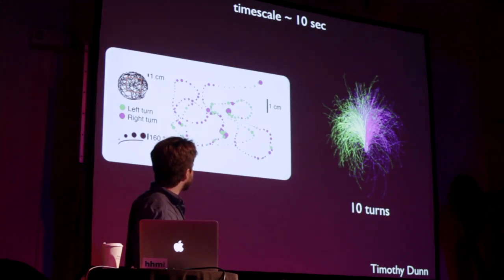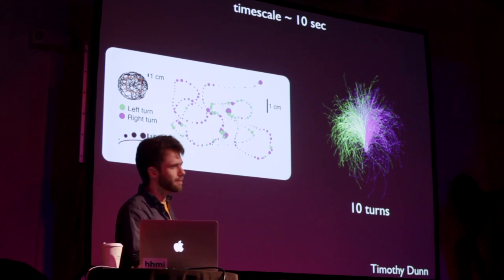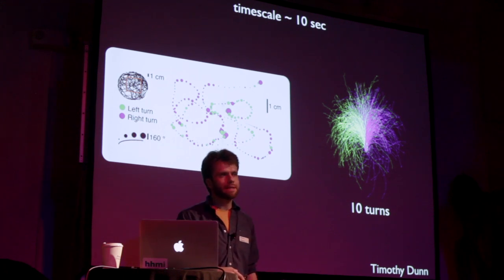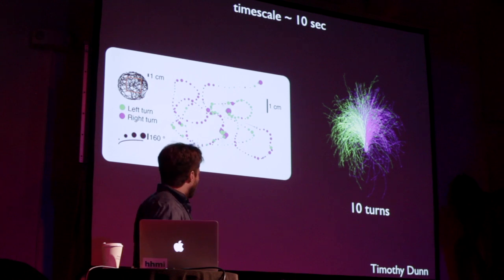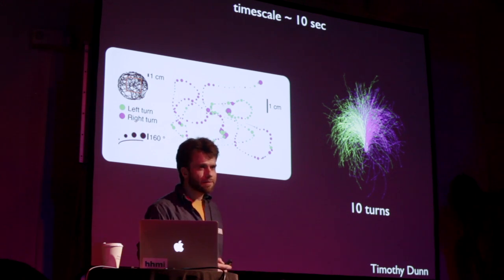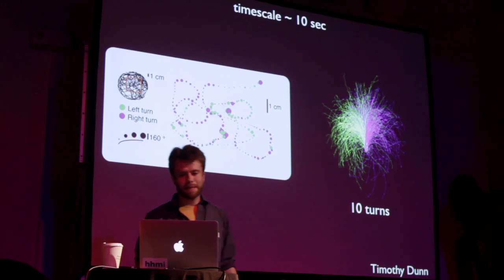And this is especially clear if you look at the projection of this path. You can see these strings of magenta and strings of green. And if you rotate the fish and look at the future trajectory, depending on whether he just turned left or right, you can see that for about 10 turns, the directionality is quite consistent. So we were wondering for a while where this might come from, and we thought maybe in the forebrain, because in the forebrain there were similarly slow timescales as in the behavior. We imaged there a little bit, nothing came out.